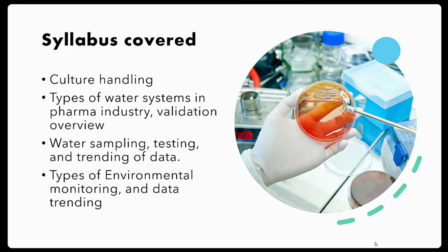Next, culture handling. Cultures are the standards which we use in the microbiology laboratory. These are the controls we will perform along with sample analysis. If the culture grows during challenging, it means the test which we performed was correct.